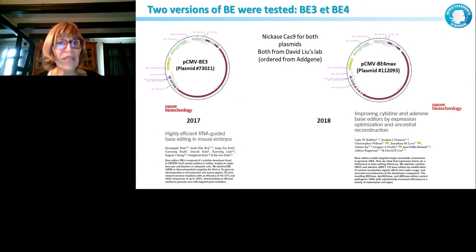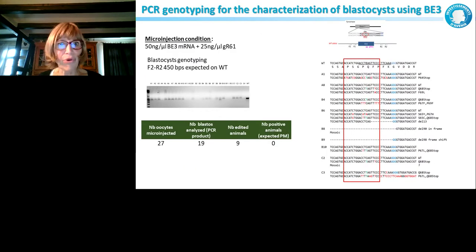So what we did, we ordered from Addgene the plasmids coding for BE3, cytidine deaminase version 3, and cytidine deaminase version 4, that were published, one in 2017 in Nature Biotechnology, the other later. They didn't test that in vivo, they just tested it on cells, but it was published and they say this base editor 4 is better than the base editor 3, the third version.